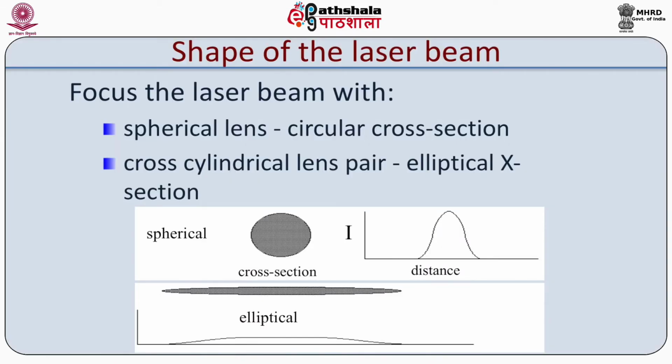Now, it is desirable that every cell passes through the energy profile of the laser in the same place and be illuminated by the same number of photons. The energy profile across any diameter of the laser beam is Gaussian or bell-shaped, as shown in this figure. For lower power lasers, it is desirable that this transit point is at the peak of the laser energy distribution. Now, when the core stream is much wider than the cell diameter, then cells which distribute at random in the core stream pass through differing laser beam energy levels, resulting in measurement errors.